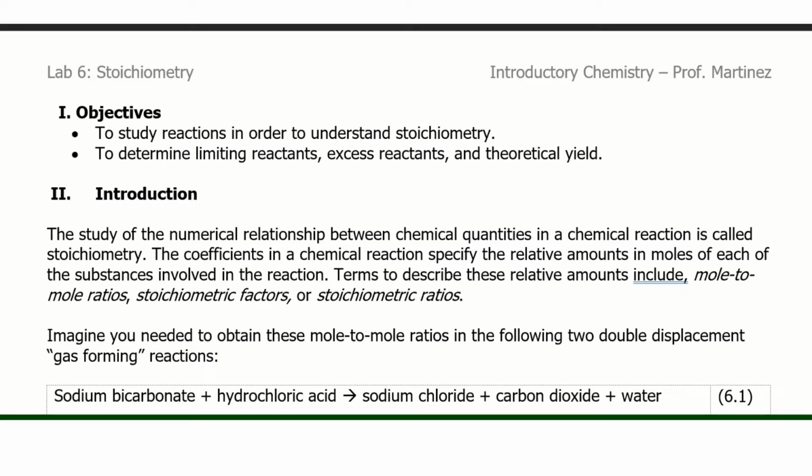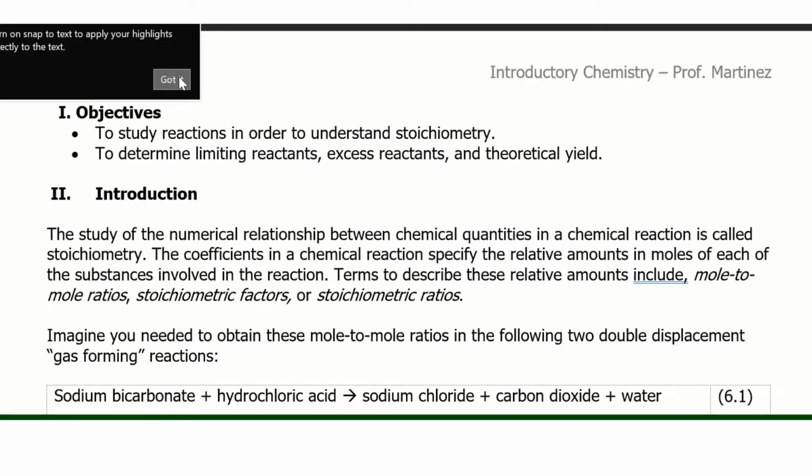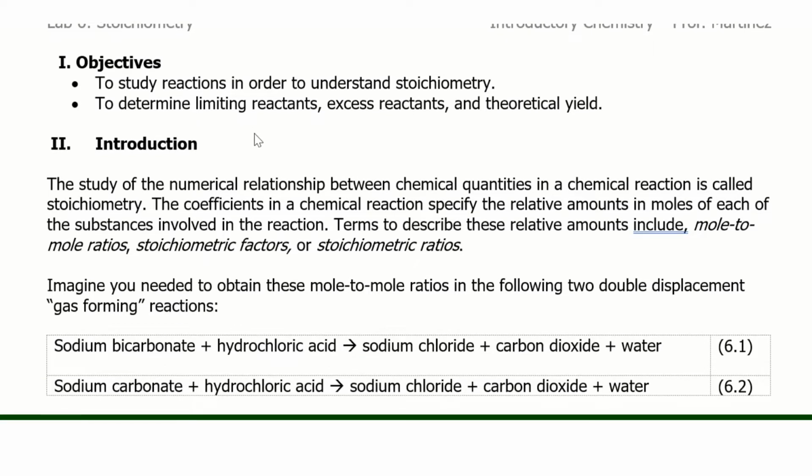Hi everyone. So in today's video, I will be discussing the main ideas of this stoichiometry lab. In this lab, you are studying reactions to overall, hopefully better understand stoichiometry and to learn more about determining limiting reactants, excess reactants, theoretical yield, all which are related to stoichiometry.